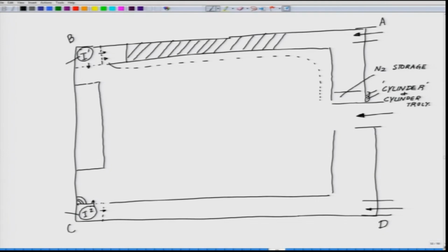Next important thing is that you have to have a sink along with a shower. This is a call you have to make. So, you probably want to have a sink somewhere out here before you enter the main area, so you want a sink and a shower.